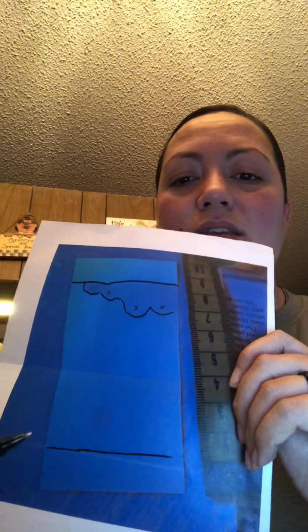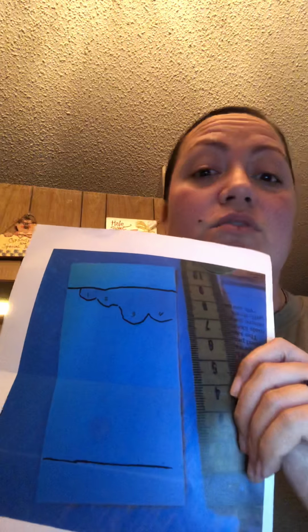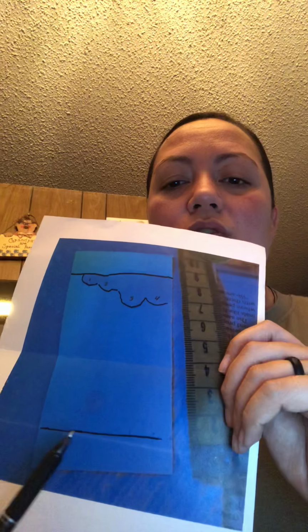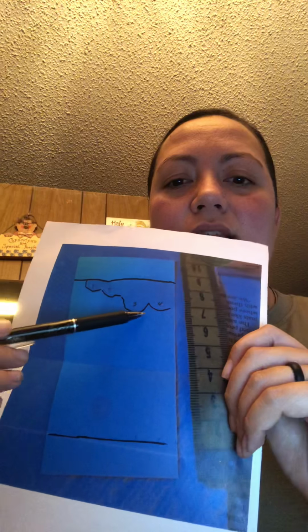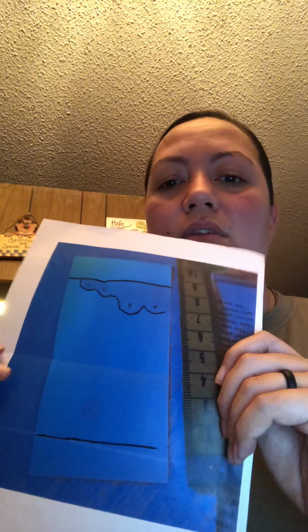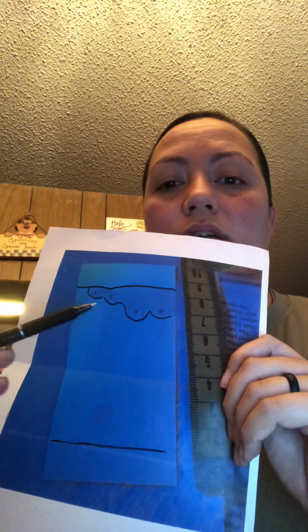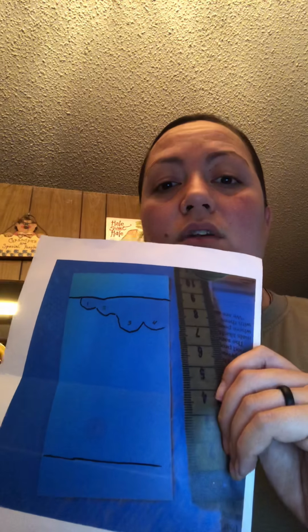So you can see one of the spots pretty well, but there are 4 spots here. And if you look at my report, there's a much better picture of the 4 spots. So here's the origin line, the top is the solvent line, and I outlined the shapes and the color results that happen there. So you're looking at spots 1, 2, 3, and 4 across this way. As you can see, 1 and 2 have very similar RF values. Spots 3 and 4 are similar values.